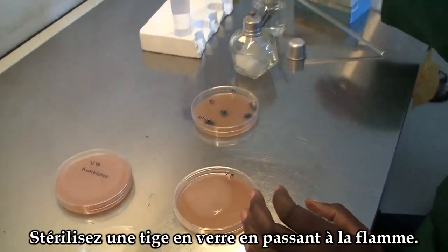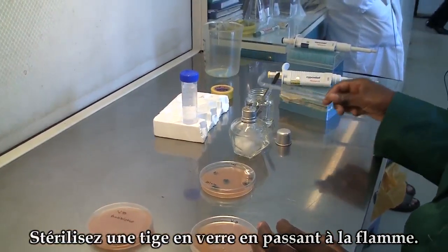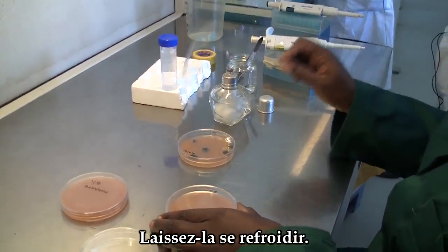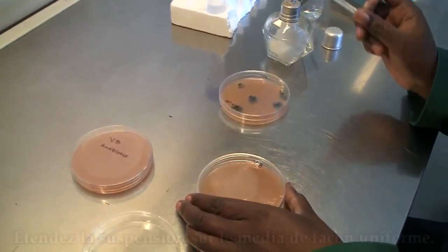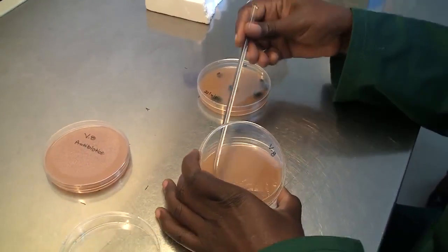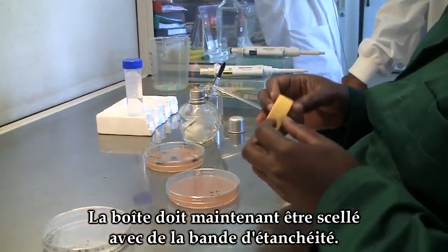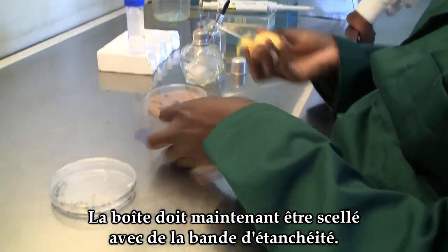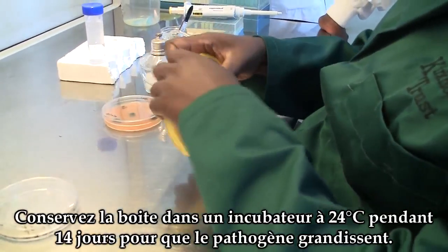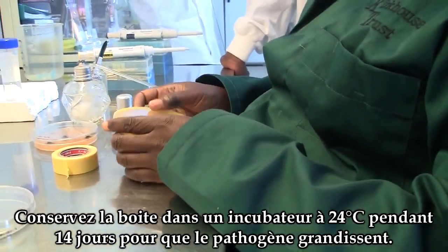Sterilize the glass rod by flaming, allow it to cool, and spread the suspension on the media uniformly. After spreading the spore suspension, seal the plate with sealing tape and store in an incubator at 24 degrees Celsius. Leave for 14 days to allow the pathogen to grow.